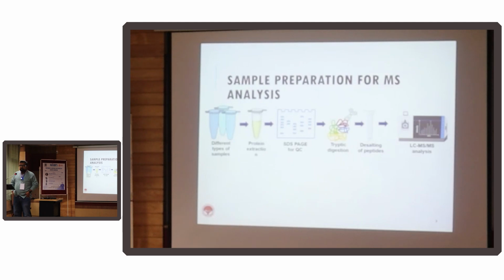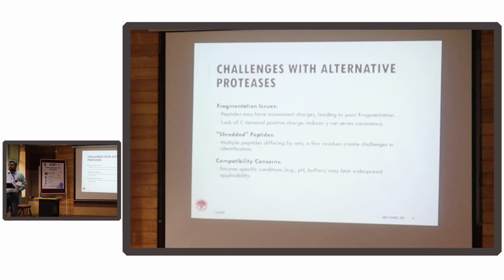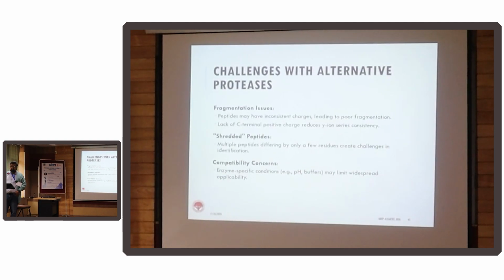So why do we do that? In bottom-up proteomics, what we want to do is recreate a broken flower vase. Suppose you have a very small camera or a microscope. Have you ever done a panorama shoot with your mobile phone? Why do we use a panorama? Because the field of view of the optical sensor is not that broad. It stitches, right? So a mass spec cannot identify the entire protein.